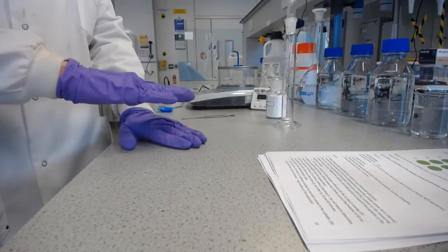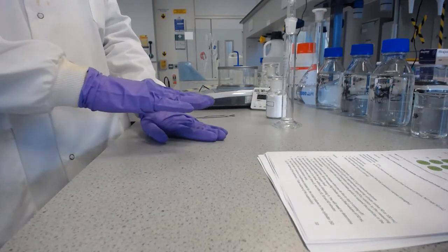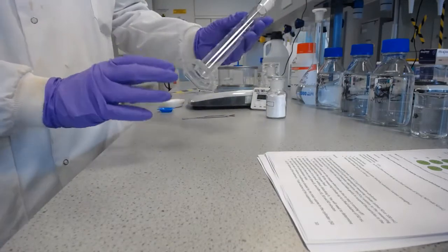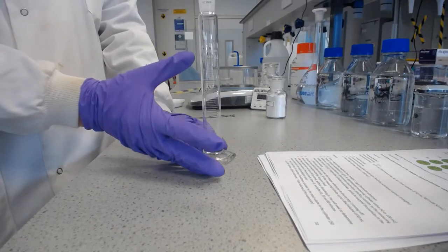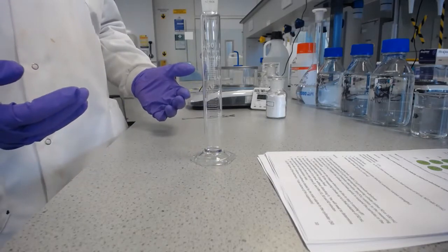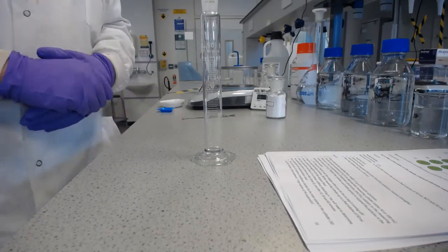And further down it goes, let's say you got down to 10 millilitres of actually having drug in it, and 40 millilitres having no drug in it, 10 and 40, that would be 10 millilitres divided by 50 millilitres, which would be a much smaller amount. So that would be 0.2 instead of 0.5 as a sedimentation ratio.